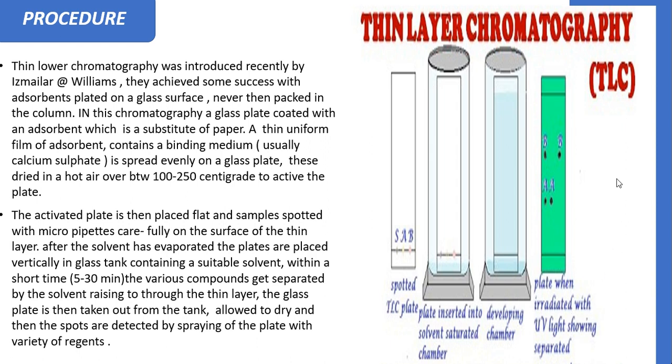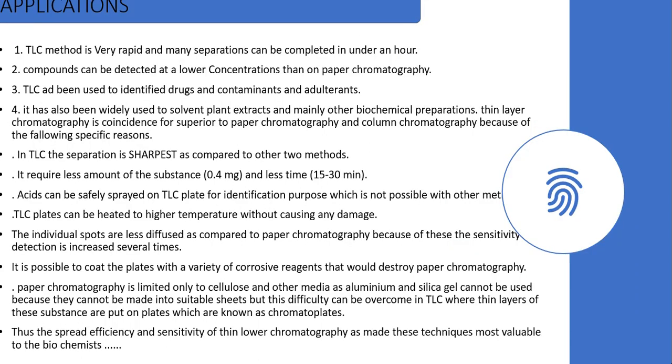Then moving to the applications of TLC. Obviously TLC is a more advanced and rapid technique, and it is more sensitive when compared to paper chromatography. The reasons are, here it takes only 5 to 30 minutes, not more than that, and we can complete many samples under an hour, and a lower concentration of samples can also be separated or detected using this.